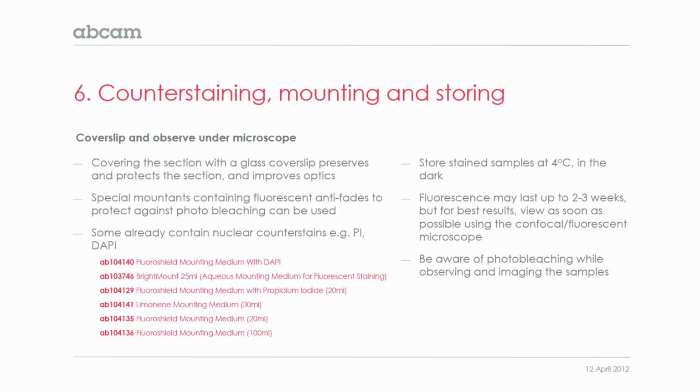So once you've mounted your slides, we'd recommend storing them at 4 degrees in the dark to protect from photobleaching. The fluorescence may last up to 2 to 3 weeks or longer, but for good results, we would say to take a look at them as soon as possible under the microscope. And always be aware of any photobleaching while you're observing and imaging the samples.